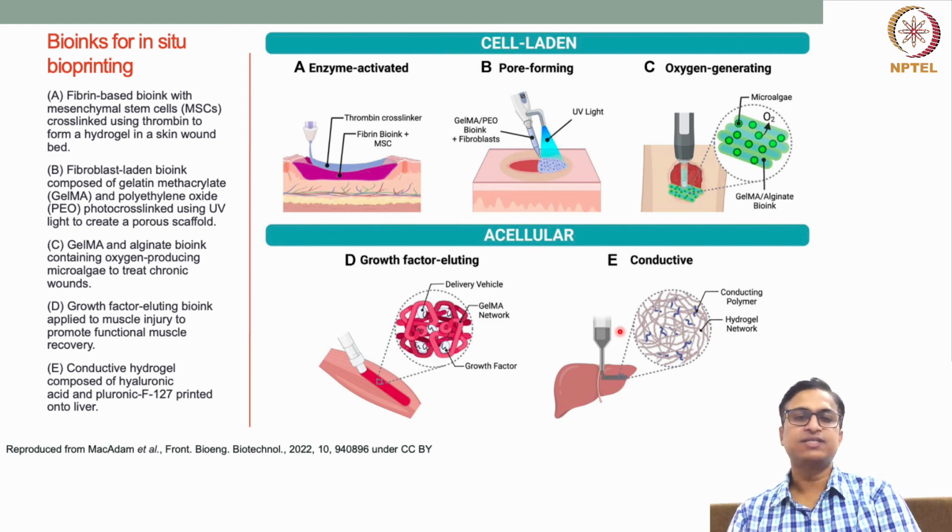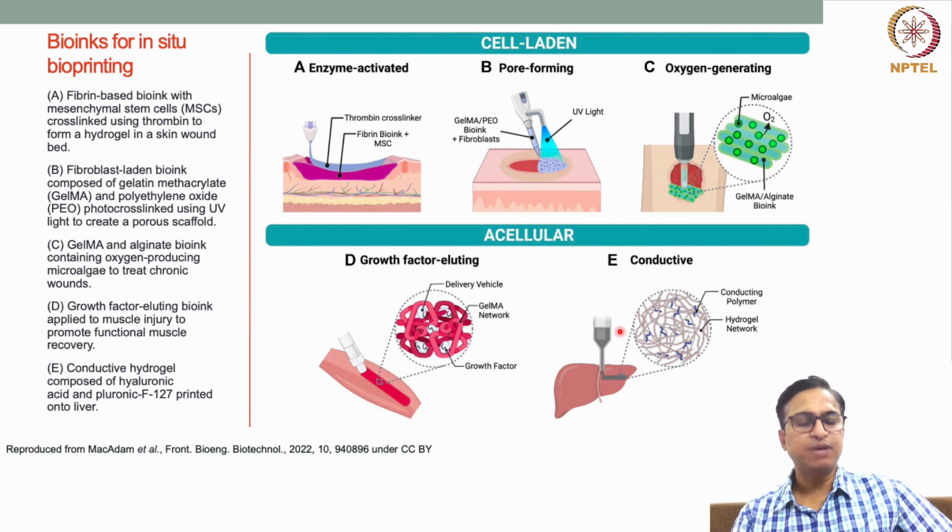So different strategies can be employed, and different types of bioinks can be used for this in situ bioprinting. Please look for more and more examples in the literature. I will also discuss a few more examples in this lecture.